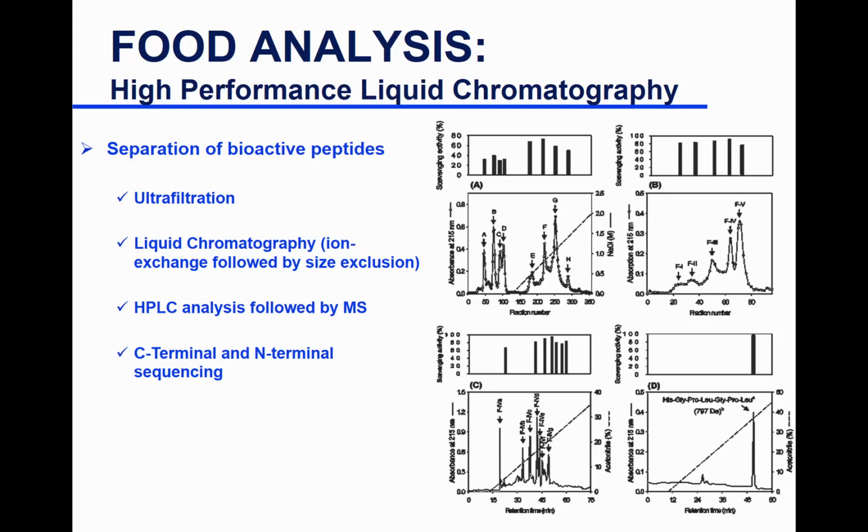Why do I say peptides? Because some peptides have the same charge, some have the same molecular size, and some might have the same polarity. In order to separate them, to Zach's point, when you have a mixture of a lot of compounds and you cannot separate them with one HPLC mode of separation, then you start with any mode of separation and you add another level.